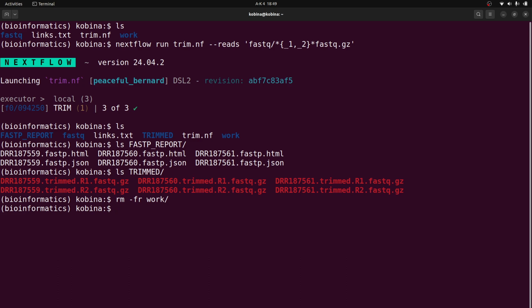You can also use the nextflow clean command to clear the files as well. Okay, so just take note of that. But make sure that you already have the files copied or stored in another directory, so that when you remove the work directory, those files are not affected. So that is what you need to know. Okay. So that is for this section.